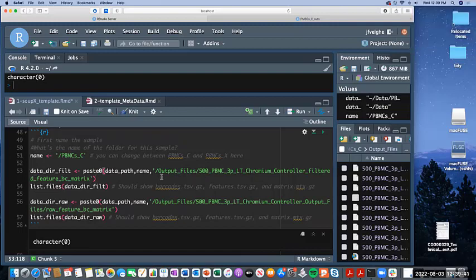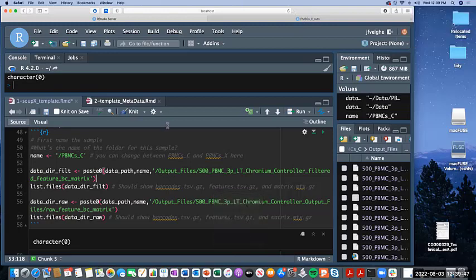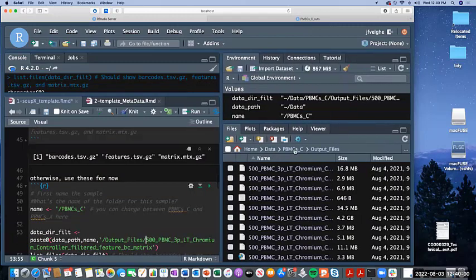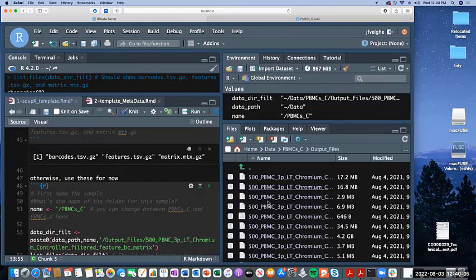Jane, can you hear me? Oh, sorry, I can hear you now. Yes. I think that these barcode, features and matrix files are not in that location, because if you see, there's no folder within the output files folder that contains these files.